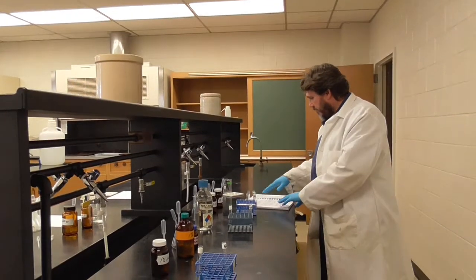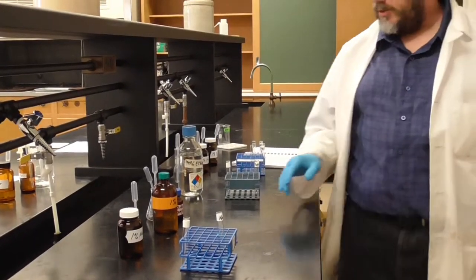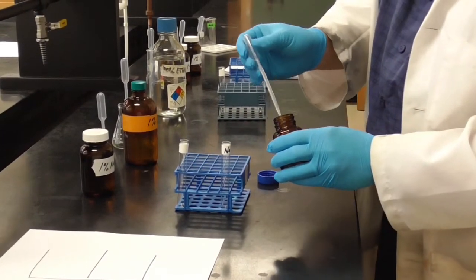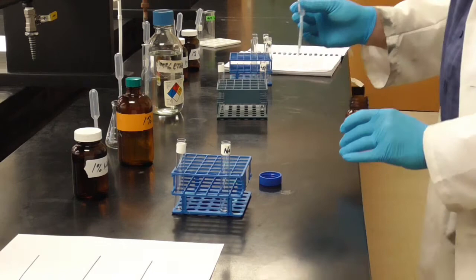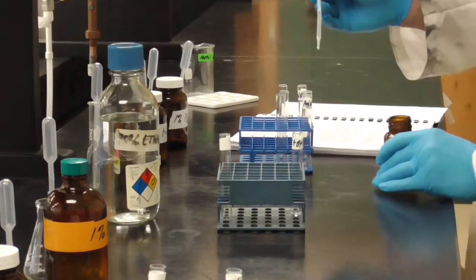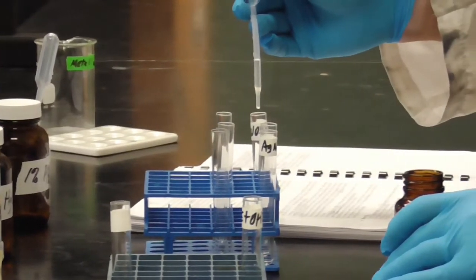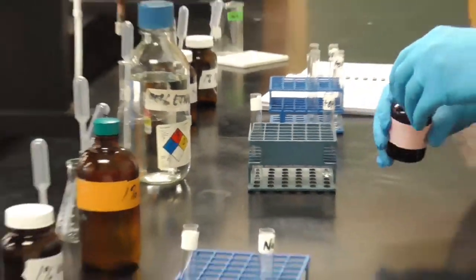Step 1, we need to place 4 drops of the amylase solution and 10 drops of the sodium chloride solution in a test tube. So, over here, in each case, we're going to need 4 drops of the amylase, which is our enzyme, in every one of these. And so I'm just going to go ahead right down the row and add 4 drops of our enzyme. 1, 2, 3, 4. This one. 1, 2, 3, 4. And then for the heavy metals, 1, 2, 3, 4, 1, 2, 3, 4, and 1, 2, 3, 4. Okay. We have our enzyme in each tube.